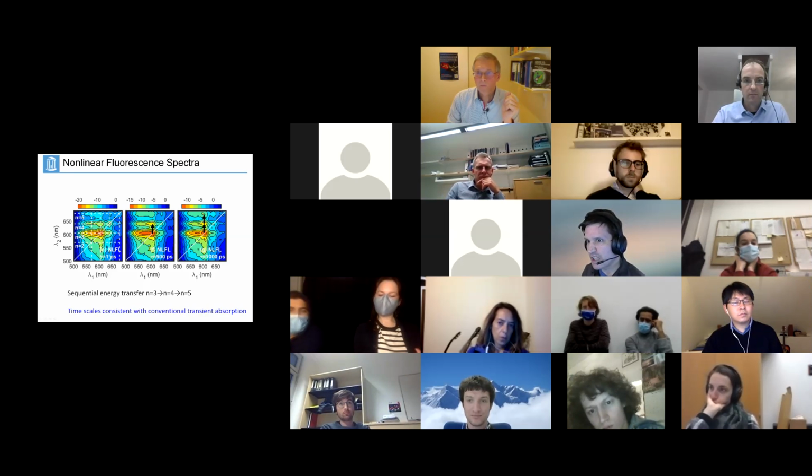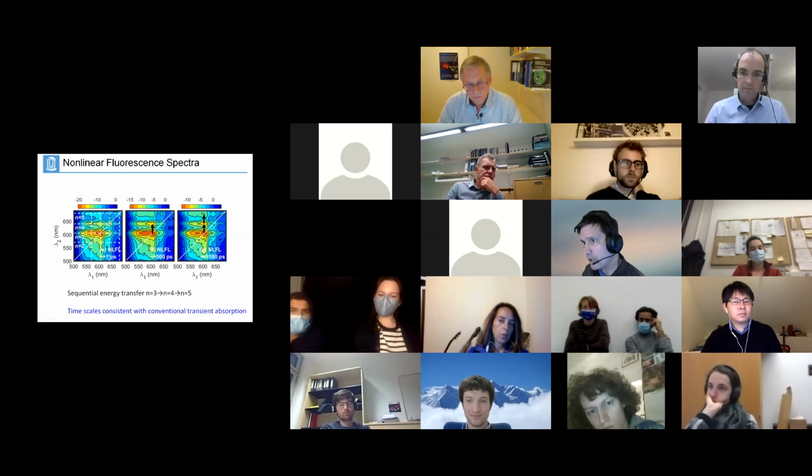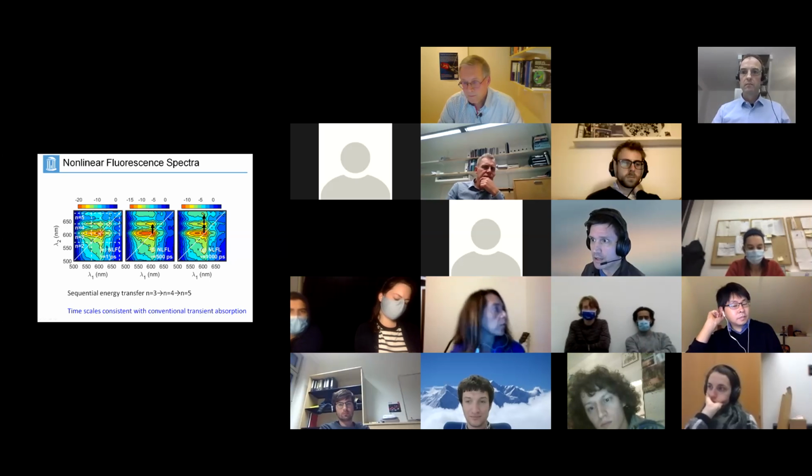We're also seeing a broad contribution that these excitons are sitting on top of in the fluorescence spectra. And I believe that comes from the direct excitation of the continuum states in the largest quantum wells, because it'll be an efficient process to directly excite those continuum states. The carriers relax and then radiate in the near infrared. So there are some differences.